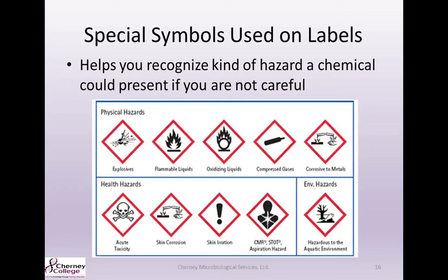The next symbol closest to that can cause severe damage and cancer-causing ailments. And then the one on the far right on the bottom row is an environmental hazard. So you'll want to make sure that you dispose of that properly.